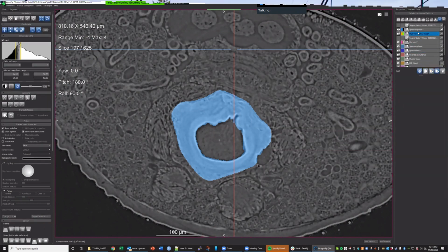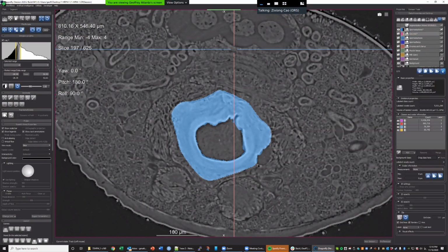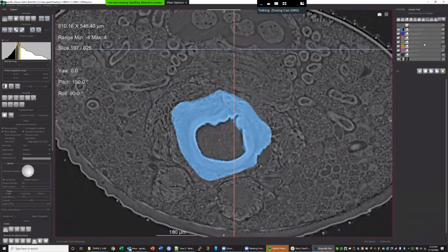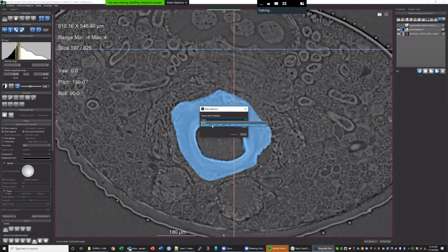I'm just going to reduce the amount of stuff that's here. Should I get rid of this other wizard? You could. We don't need it today, so you can always start later. I'm going to shut off everything that we're not working with. You could multi-select if you want. Can you wait a minute? Sure. I'll let you take control.